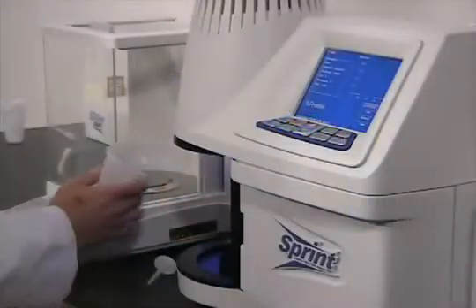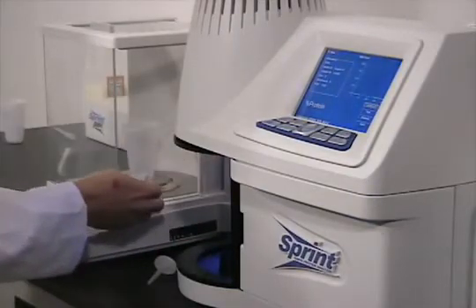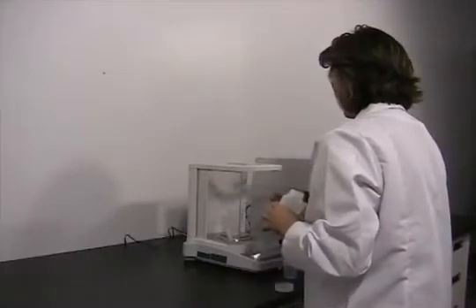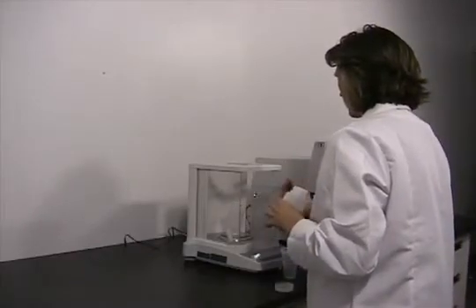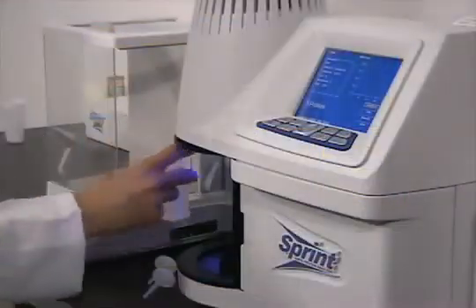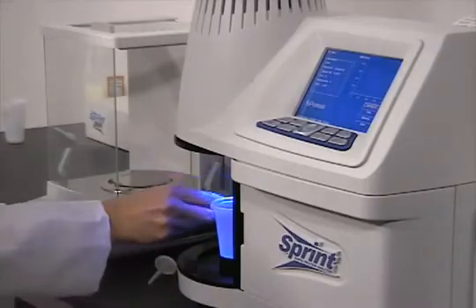Sprint is extremely easy to use. Food samples are gathered using standard methods. You tear a sample cup, transfer a sample and, with the push of a button, record the weight. Take the cup out of the balance and place it in the Sprint along with a new filter, and then start the run.